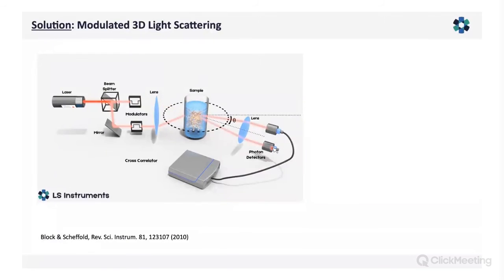This way we can select the Q1, Q2 that I showed you before. So we only measure one single, identical scattering experiment each time that fits to each other, and we don't measure the three other combinations that don't contribute to our signal and only contribute to the noise. In very lay terms.